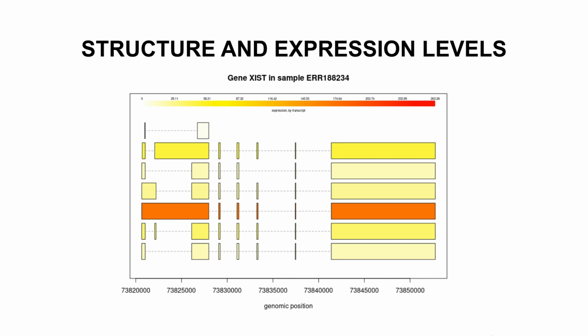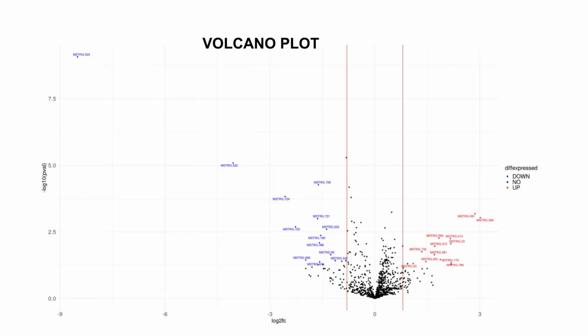Now let's look at the next figure, which is the volcano plots. Volcano plots are 2D scatter plots that have the shape of a volcano. With volcano plots, the log2 fold changes is on the x-axis, and then on the y-axis we have the negative log of the p-values. And by setting a threshold, you'll be able to identify genes that have been expressed significantly. So that means we are looking at significantly expressed genes. That's what you can use the volcano plots to do.